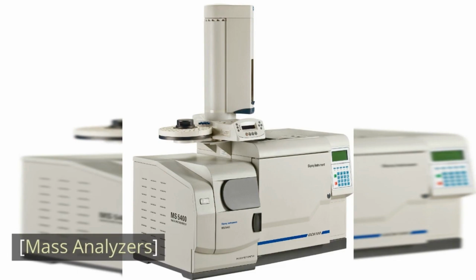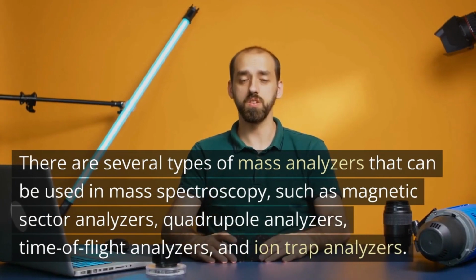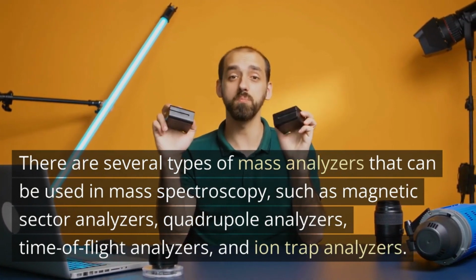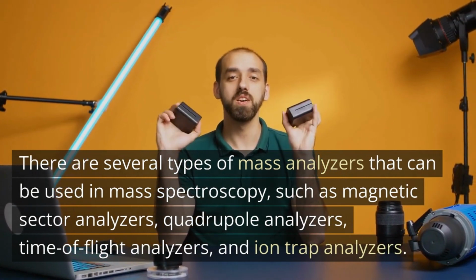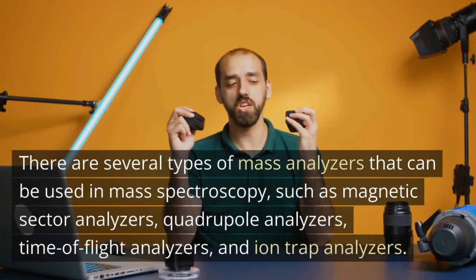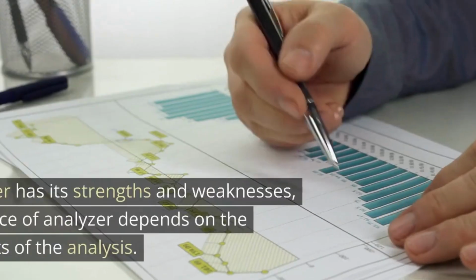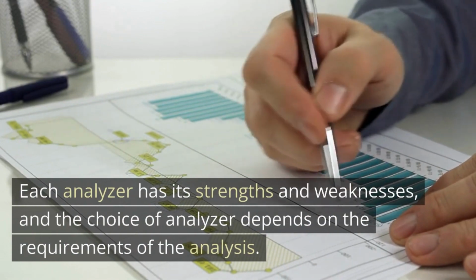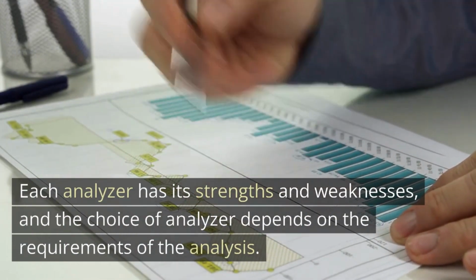Mass analyzers. There are several types of mass analyzers that can be used in mass spectroscopy, such as magnetic sector analyzers, quadrupole analyzers, time-of-flight analyzers, and ion trap analyzers. Each analyzer has its strengths and weaknesses, and the choice of analyzer depends on the requirements of the analysis.